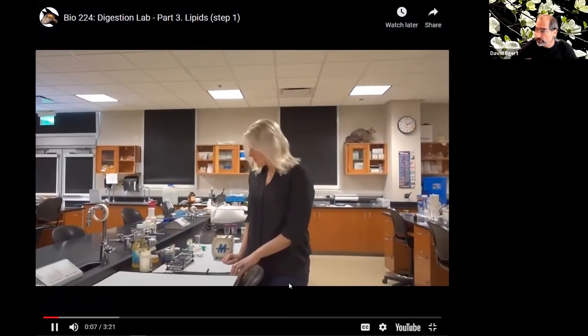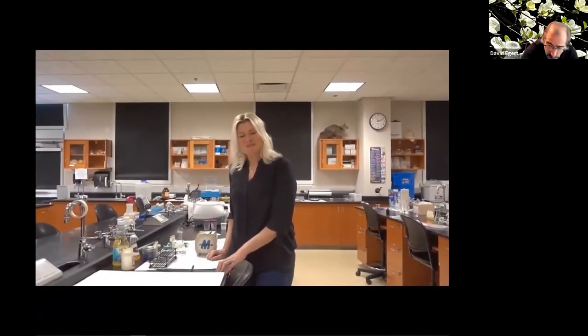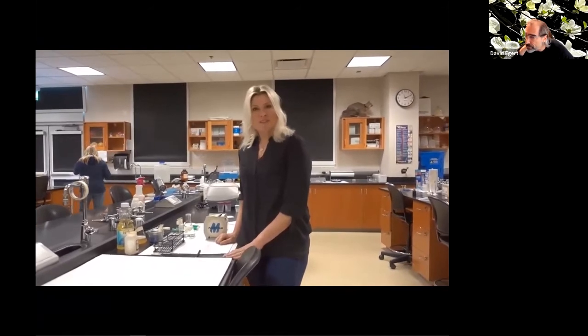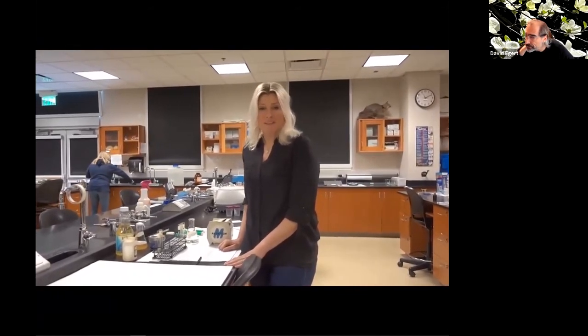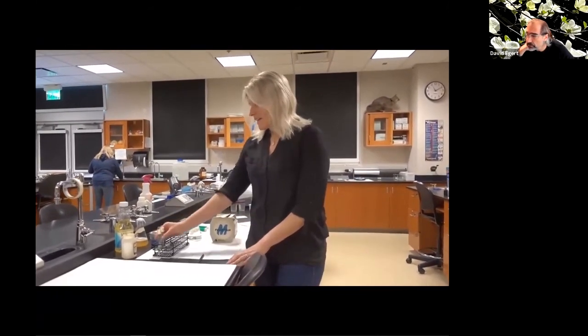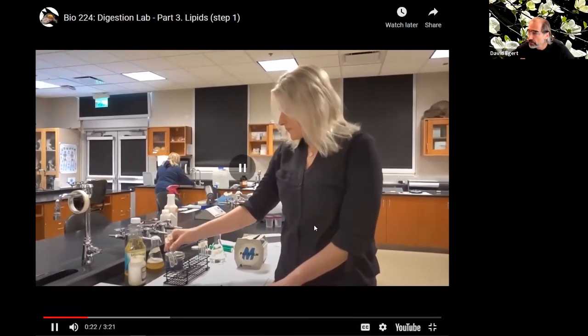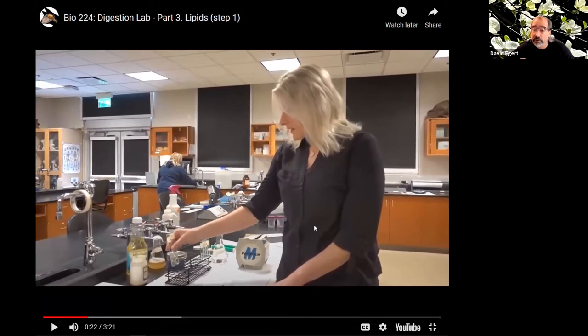All right, so here I'm demonstrating part 3 of our digestion lab, and the first part is to investigate the properties of bile salts and how they can emulsify water and oil. In your lab write-up, you should describe what you see in this video.